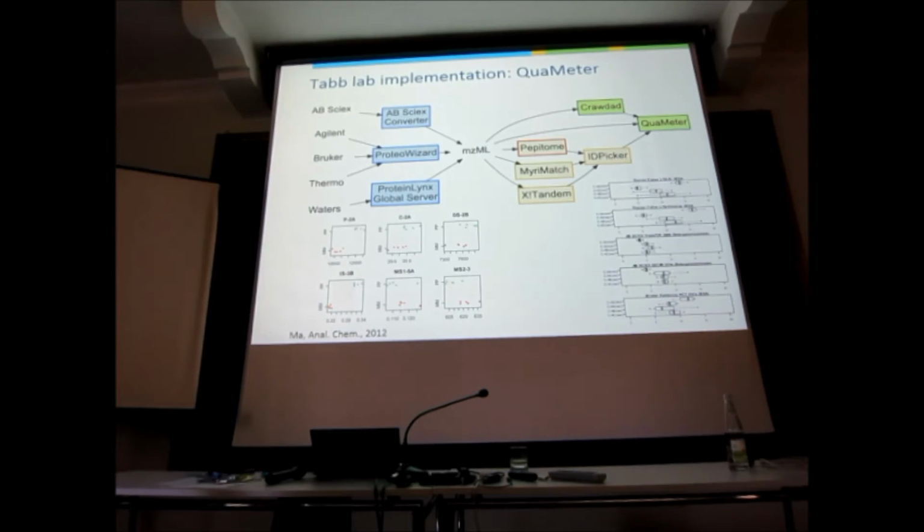The NIST stuff was only Thermo. And it actually uses standard formats and open software to give you all of these things and nice plots in R. So you see the same kind of thing we've seen before, but now plotted in R. So this was a very good step in the right direction.